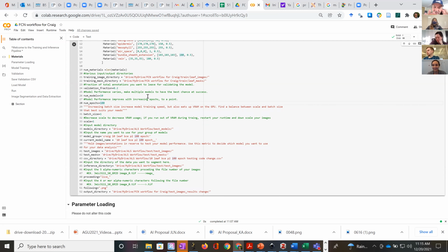So once you have a generalized model, this thing will fly through a 500 image stack. If the images get really big, it slows down. When I run 2560 by 2560 images, it takes longer, but that's really just the reading and saving process through Google Drive. The actual inference for each image is around 1/100th or 2/100ths of a second per image.